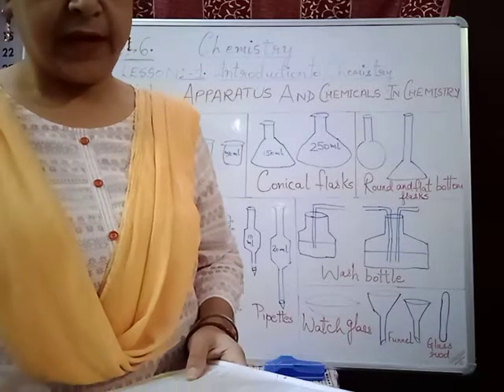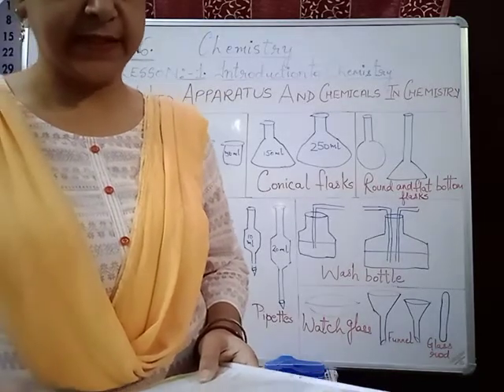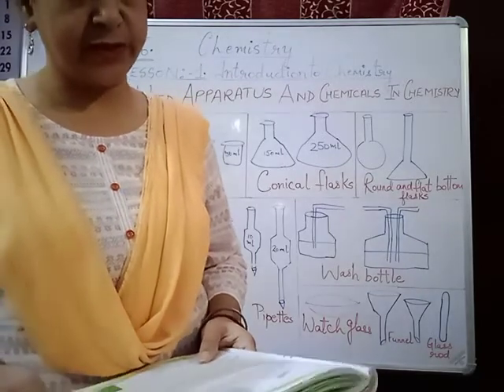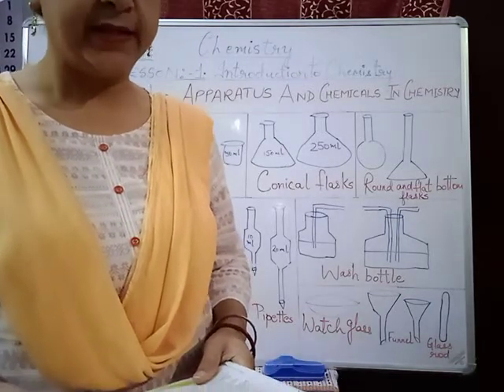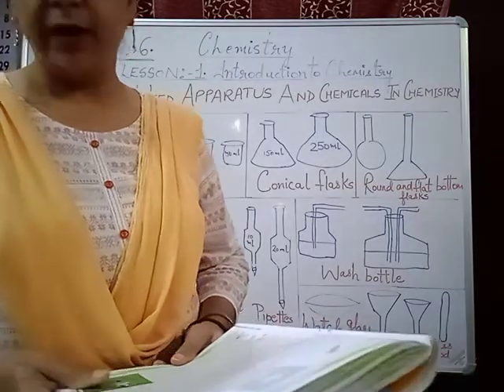Bunsen burner. It is required for heating purposes. It is connected to an LPG gas cylinder through a rubber tube. There is a Bunsen burner which is used in the laboratory, and the same gas which is used at home is provided in the Bunsen burner.